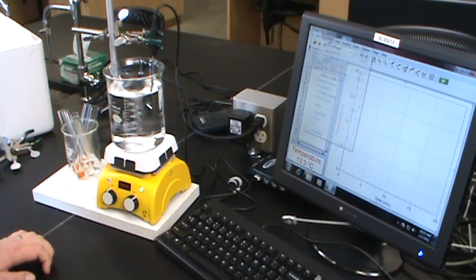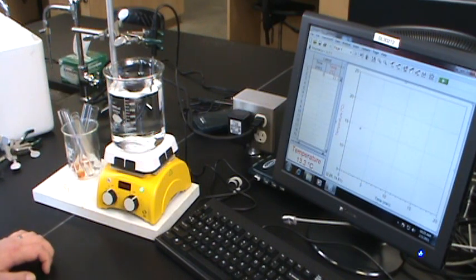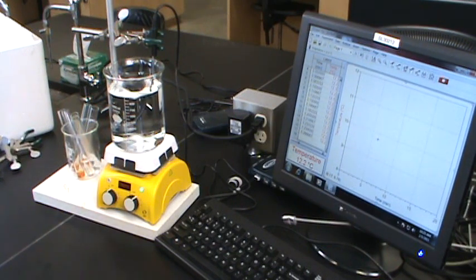Let's stop this. Go back to data collection, and when I changed some of these settings, it changed to doing 1 sample per minute. Let's do 60 samples per minute so that it's sampling every second. Restart the data collection. And you see we've already cooled down quite a bit. So let me rescale this again. Let's go to 12 degrees and let's go to 8 degrees. So now I really zeroed in on exactly where I want to be.